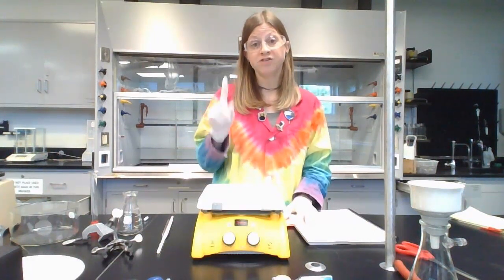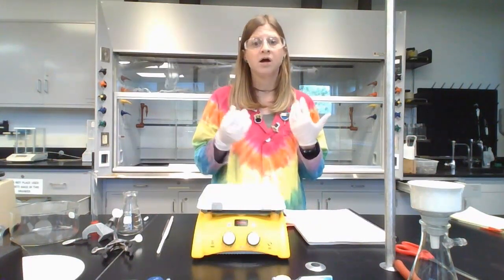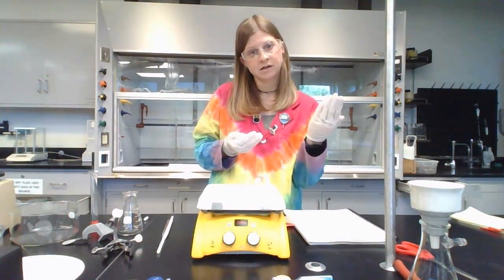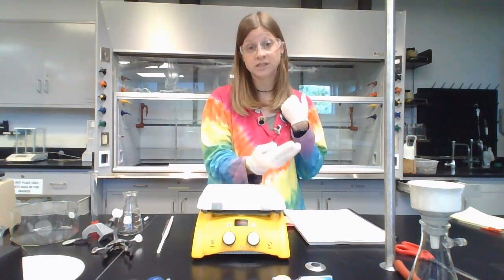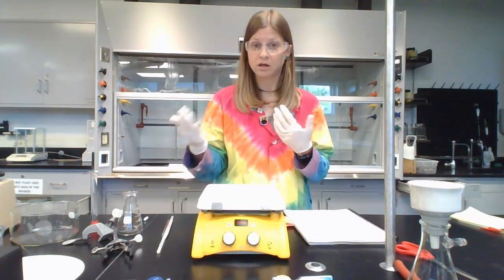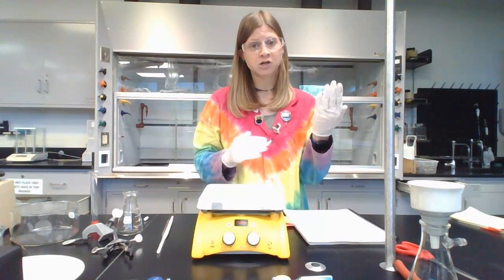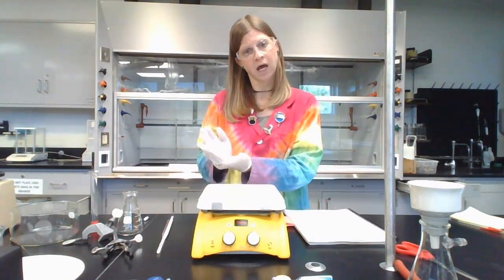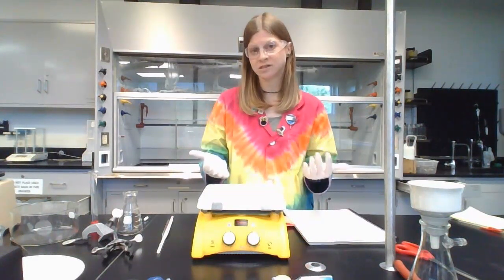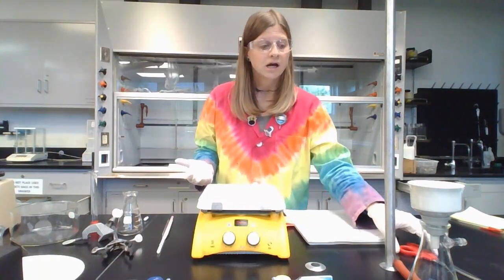We're going to do the phenol test, which is a color test. It's going to tell us the presence or absence of this functional group, a phenol. So we're going to test the starting material, salicylic acid. We're going to test the product that we made, and then we're going to test pure aspirin that we purchased and know is aspirin. Based on how the salicylic acid starting material and the pure aspirin behave, we'll be able to look at what happens to the thing that you made and get some information on how successful you were. Even that doesn't necessarily guarantee anything.